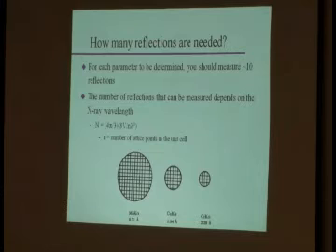This is what you want to look at if you want to decide whether a certain wavelength will do for your experiment. Okay. Now I can already tell you, if you guys are working on proteins, you'll probably have enough reflections. Okay.